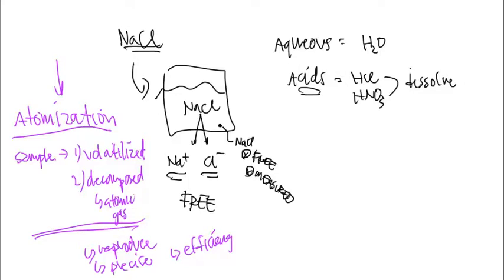All right, so there's going to be a couple of important components for an AA instrument. And we're going to talk about these components in more detail one at a time in the upcoming videos. But these components are going to be the same for any spectrometer that I want to talk about or that I want to use in a laboratory. So there's going to be some common themes here. If you're taking the course, what you'll find out is that the terminology of these pieces and parts are the same as what you've talked about so far up to this point.